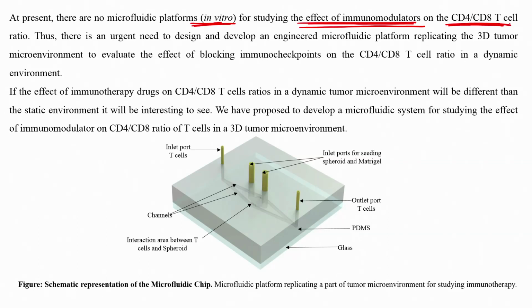Thus, there is an urgent need to design and develop an engineered microfluidic platform replicating 3D tumor microenvironment to evaluate the effect of blocking immunocheckpoints on CD4 CD8 T cells in a dynamic environment, right. So, if we want to check the effect of immunomodulators on CD4 CD8 T cells, we need a dynamic platform, but currently there are no microfluidic platforms that are used for this kind of study.